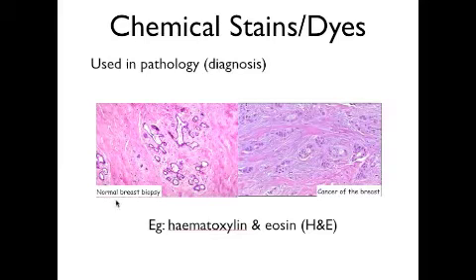Here, we can see that it's a normal breast biopsy because you can see normal tissue surrounding the ducts. But this one, you can see that it's not actually that normal because you can't really even see the ducts or anything. So this is a case of cancer.